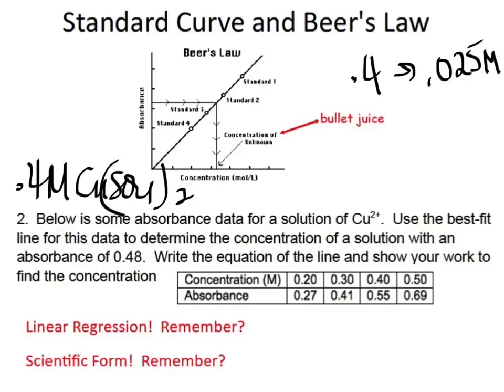I wouldn't worry about not coming up with whole numbers for the molarity. I would worry about doing, say, 3 mLs of my copper sulfate with 8 mLs of water. I would want to use whole numbers in my dilutions rather than whole numbers on my molarity. Does that make sense? Because you're going to be measuring 10 mLs, and trying to measure 5.43 mLs of something is harder than measuring 5 mLs of something.